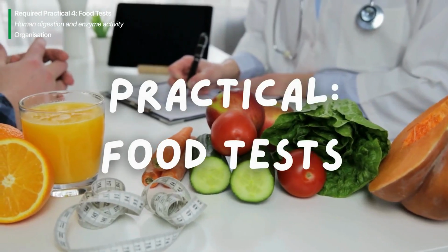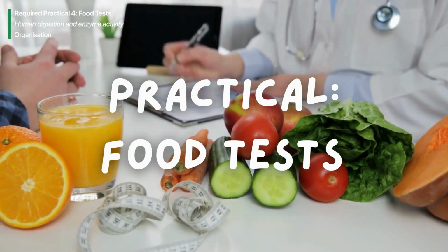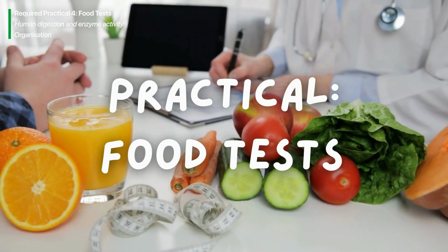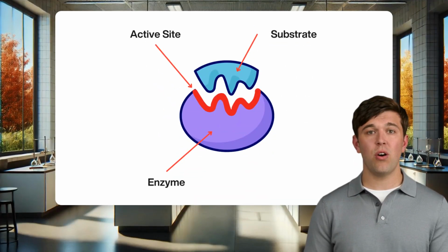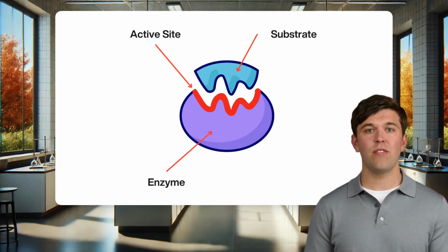Hello and welcome. Today, we're stepping into our laboratory to conduct a practical experiment to test for food molecules. So far, we've learnt about the activity of enzymes in our lessons. We understand that enzymes are specialized proteins that catalyze biochemical reactions, making them essential for various bodily functions.